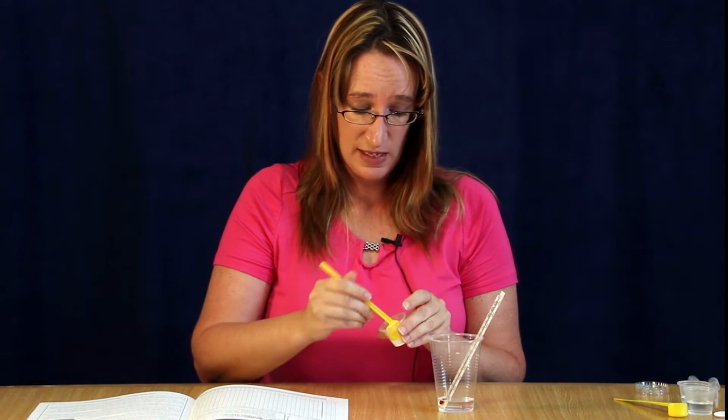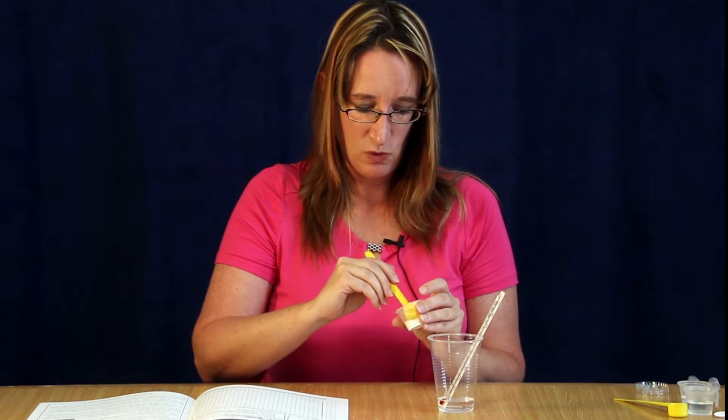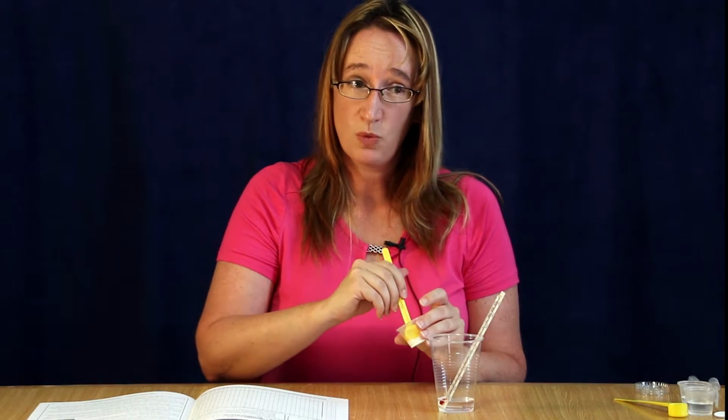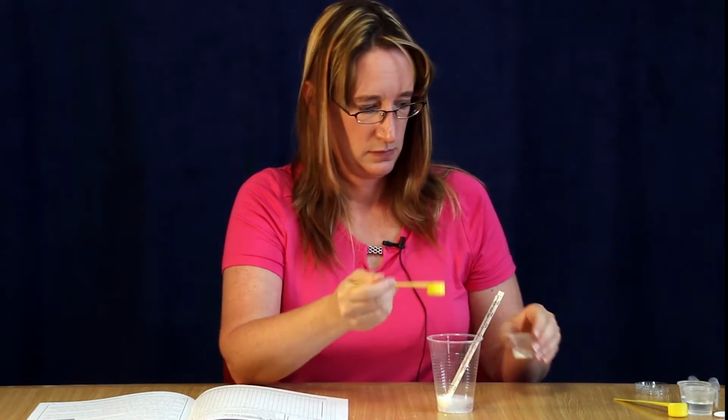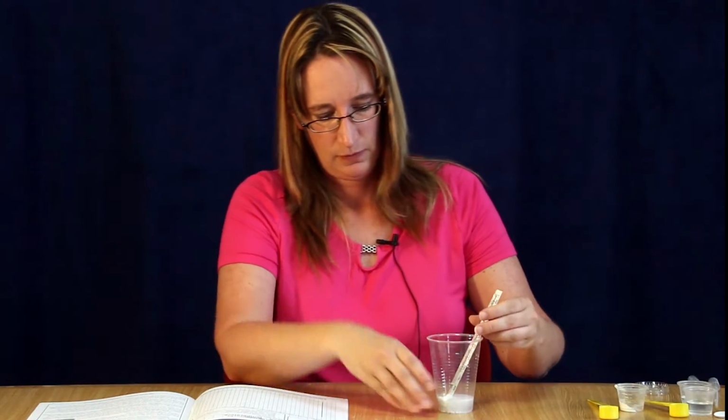And remind them that as soon as that baking soda gets in there is when they're going to want to start recording their time. And you can stir that up a little bit to make sure that the reaction occurs. And then they'll just want to watch the temperature change.